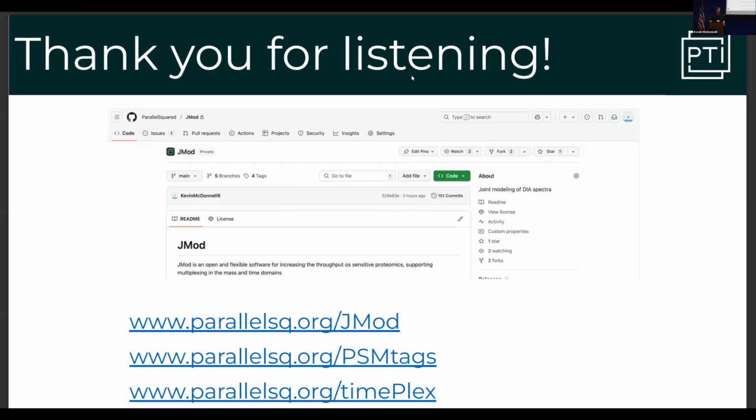One of the biggest trade-offs that you have when you are labeling with TMT is a loss of dynamic range, that is, getting larger the more plexes you're using. So how big is this loss of dynamic range when you're doing plex DIA? As I said, yeah, this is the next step to explore. So we looked at a 4-fold change. We didn't see a lot, but I guess, do you mean dynamic range in terms of different molecules or in terms of the same peptide analyzed?